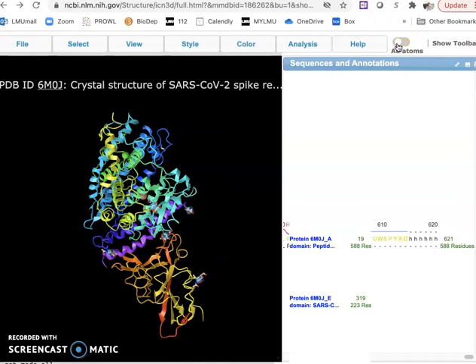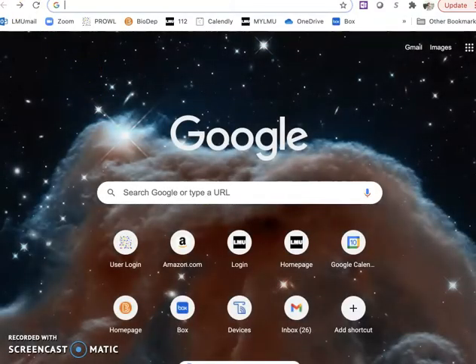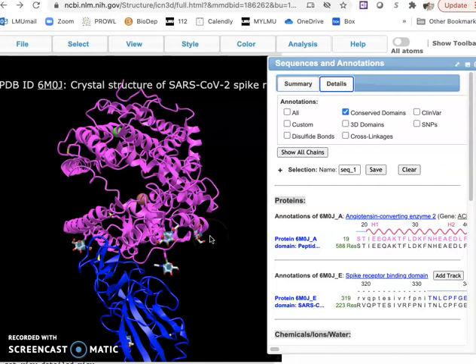Right now, since I selected a couple of them, I have the selection turned on. So if I want to deselect, I'll click on all atoms to deselect and move into the next step, step 9, where we visualize certain amino acids.